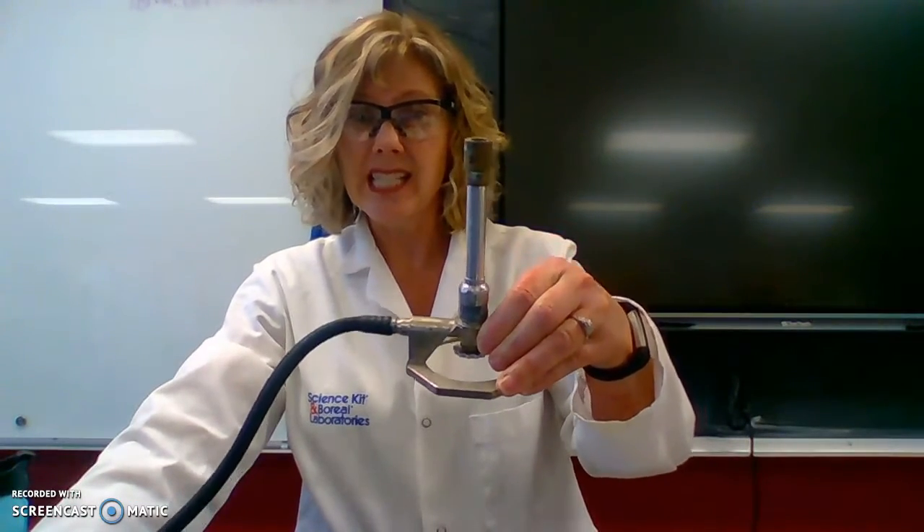So when we talk about Bunsen burners, this is the thing we're talking about right here. I know you can't see the whole thing in the video. I'm going to go through just kind of how to use one and a quick little activity with the Bunsen burner.